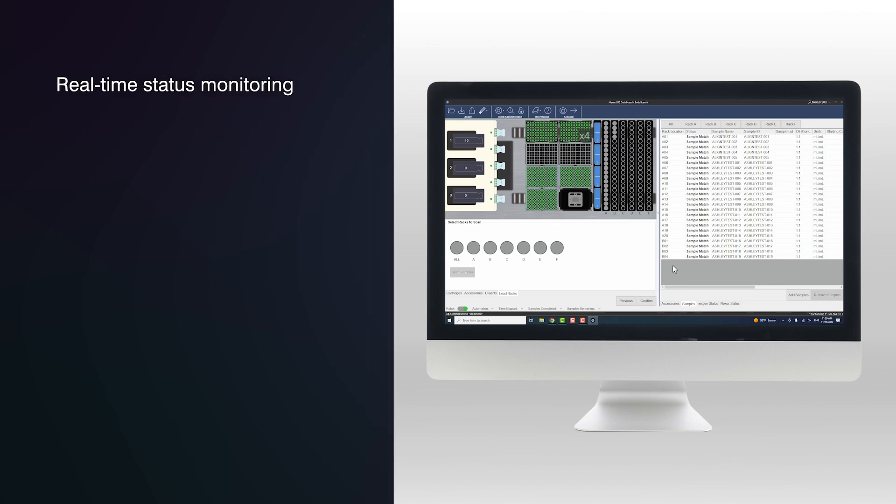Run information can be viewed in the Nexus 200 and NextGen status tabs. Users can hover over multiple locations on the deck view to highlight information about the corresponding accessory or sample and its status, which allows for real-time status monitoring of the runs.